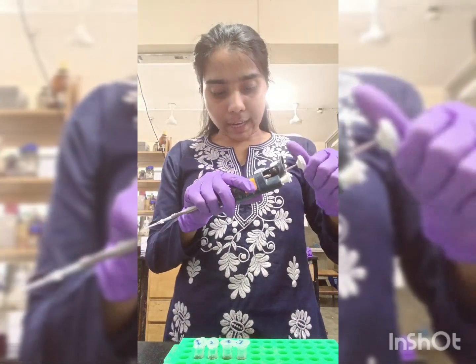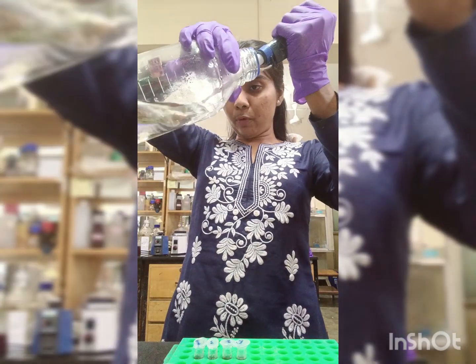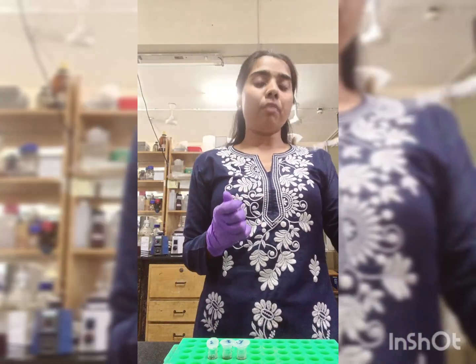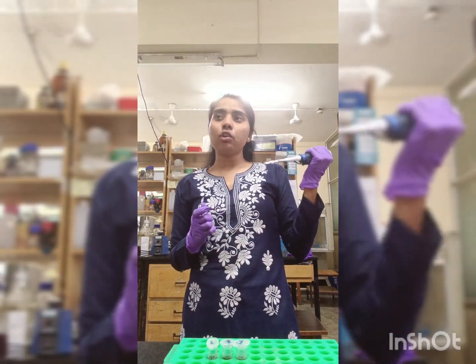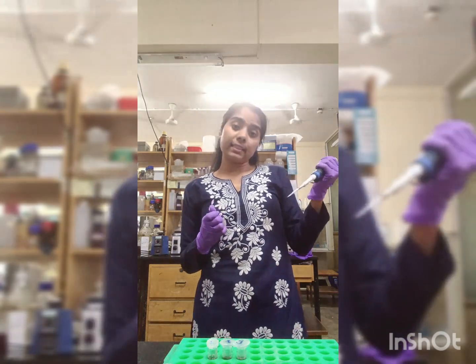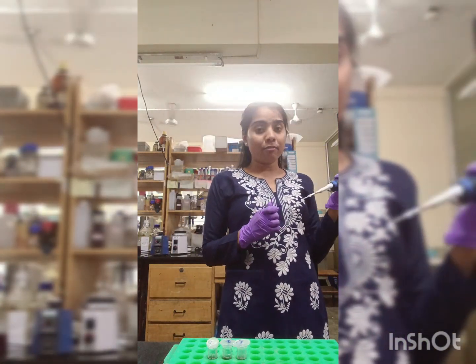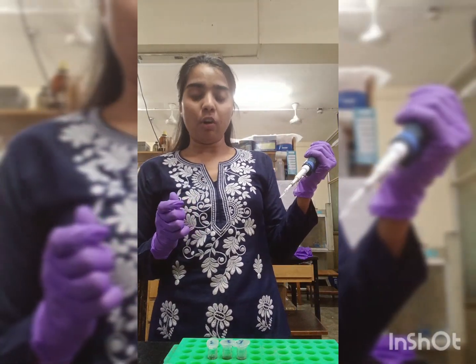And 18 microliter in the test sample, because my protein is already concentrated, so I will make sure that the protein concentration should be less than 1 mg per ml in the test solution, because through Bradford we can detect up to 1 mg per ml protein concentration.